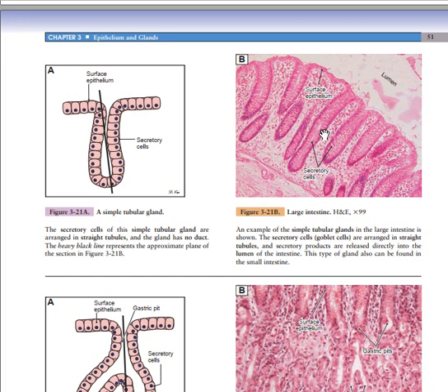Now to know the function of this gland, you may increase the magnification. The function may be serous, and we have seen the morphology of the serous gland just above. You can pause and go back and see it. We said that the serous gland on the hematoxylin and eosin stain is going to be much more pink, while the mucous gland is going to be much more whitish, and the apical part is whitish. The mixed gland has a demilune of the serous gland, then the midpoint is mucous gland, and then on the other side another demilune of the serous gland.